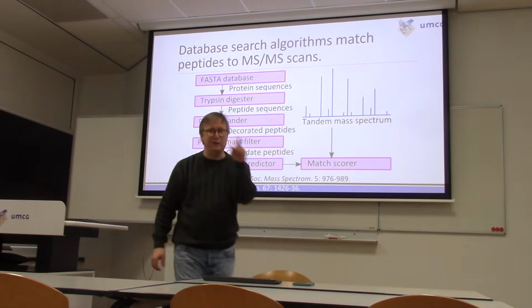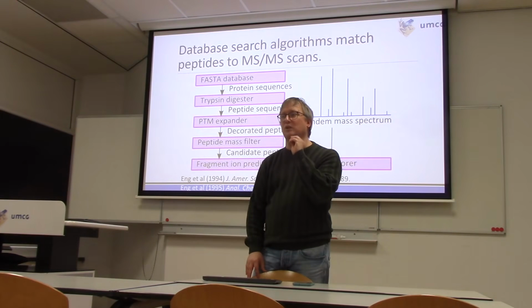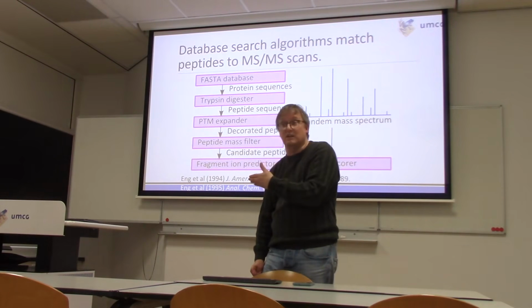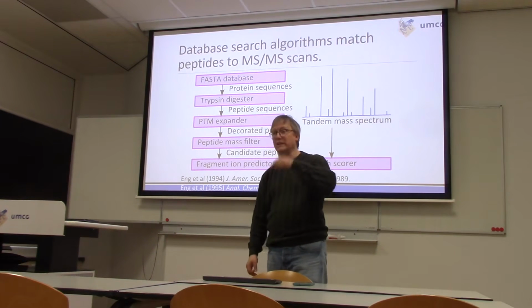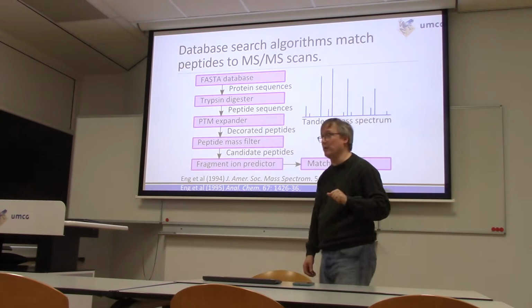Okay, but hopefully what you picked up from that was that when you hypothesize a peptide is represented by an MSMS, you can then look up which fragments are detected for that sequence in that tandem mass spectrum, and from that gain confidence that this peptide really is reflected by this MSMS. Okay?